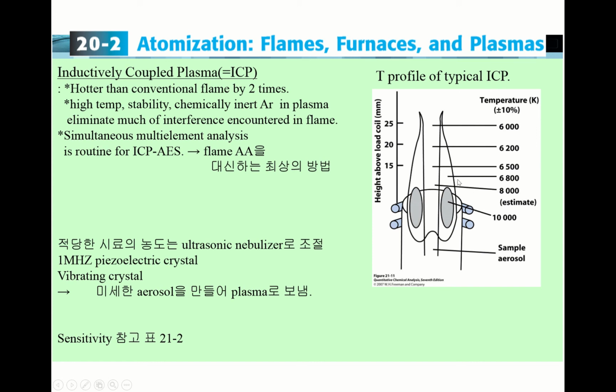You see, the temperature is maintained at a very high level. This now is 2 turns around this one, the induction coil, 41 megahertz.